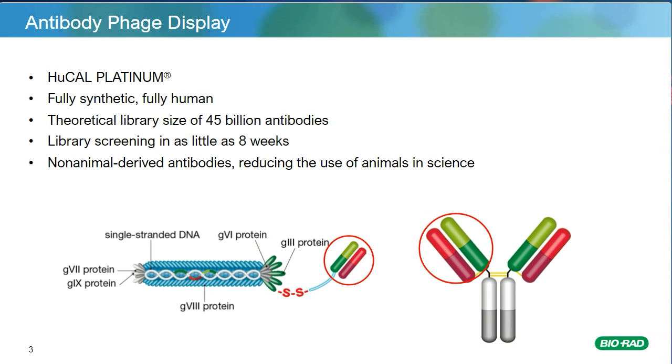Fabs are encoded within a phagemid and expressed on the surface of recombinant phage within infected E. coli cells, providing then a link between the phenotype and the genotype of that phage. We then use phage display as a tool to select for antibodies of interest by mixing our phage library with target antigens and enriching the population of phage-expressing Fabs that will specifically bind to that target, whilst washing away non-binders. This process is described as panning.